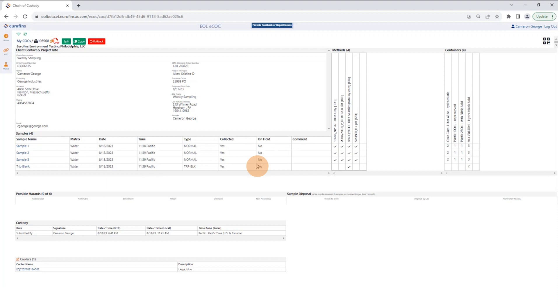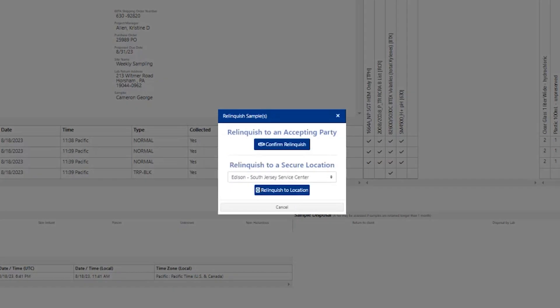The next step is to physically relinquish the samples to the laboratory. When you're ready, there's a blue button in the upper right-hand corner — click Relinquish and a pop-up window will appear with two options. You can confirm the relinquish to an accepting party, which would be in person at one of our locations. Or you can relinquish to a secure location — for example, if you're leaving samples in a drop box or dropping them off with FedEx or an outside courier.